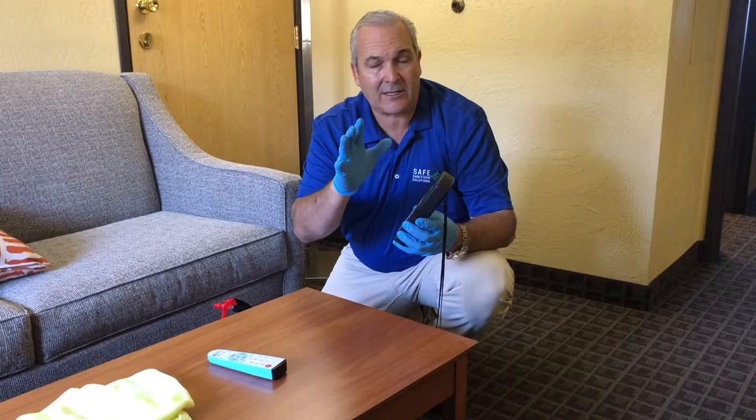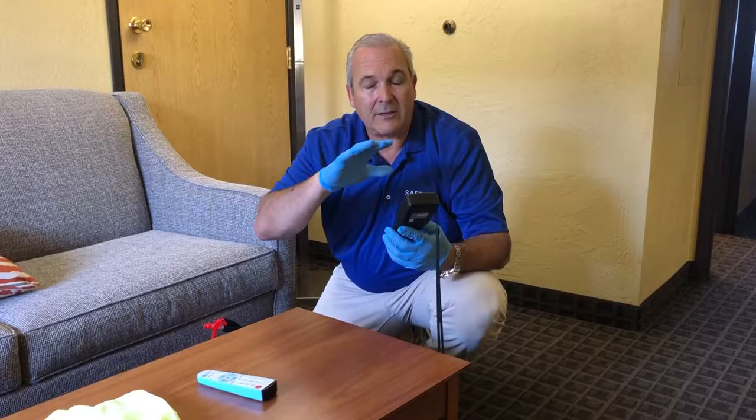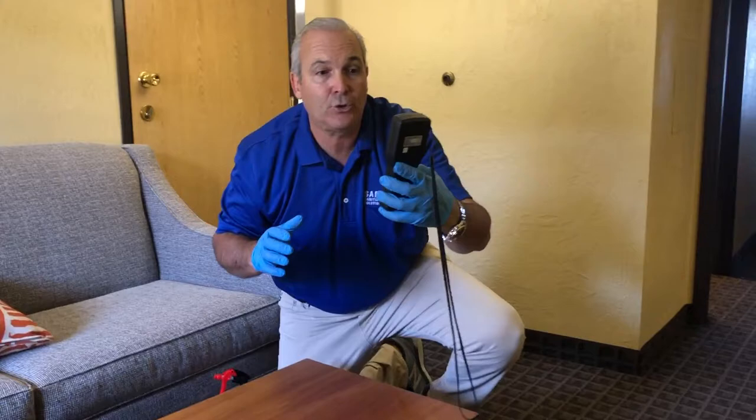It's actually a surfactant — it can get towels, bathtubs, all of your faucets, door handles, glass and mirrors, and tables. And wow, this is amazing. I want you guys to look at that — we got a 2. A reading from 241 down to 2, which doing the math is about a 99.17% kill log rate.